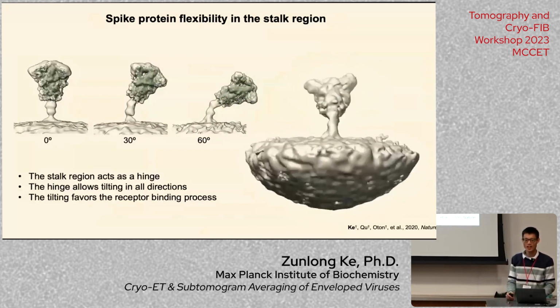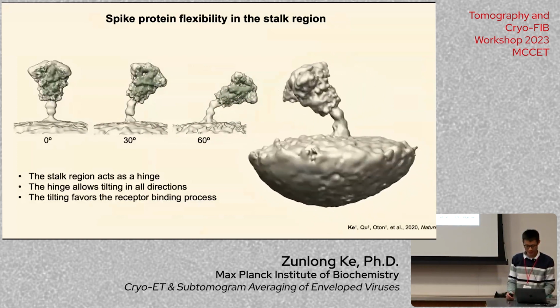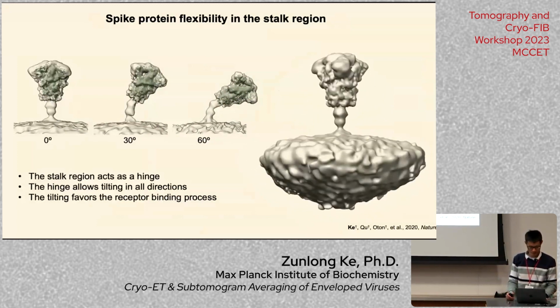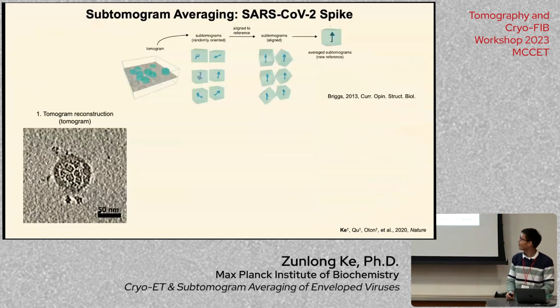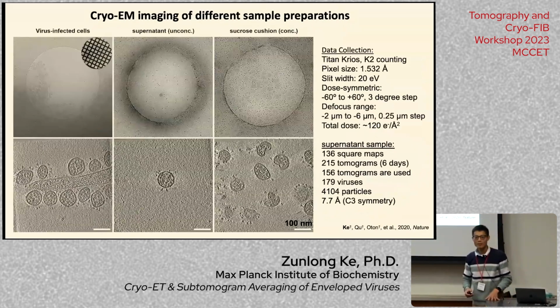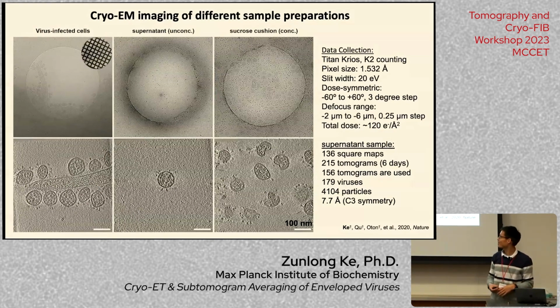Okay, question for you. On your collection parameters slide, what's your feeling about objective apertures? Apertures. I think it's good. I have it in, 70 microns or something. Yeah, I have it. I think it helps. I mean, I'm not going to get 2 angstroms, so.